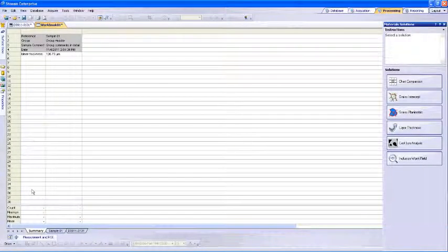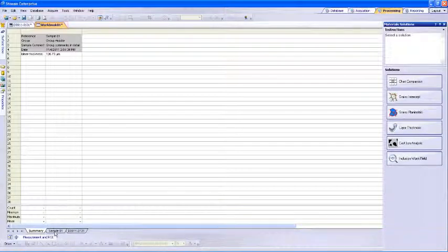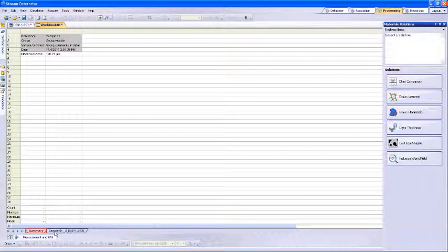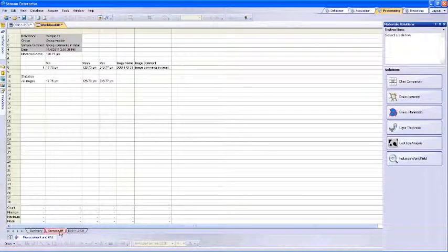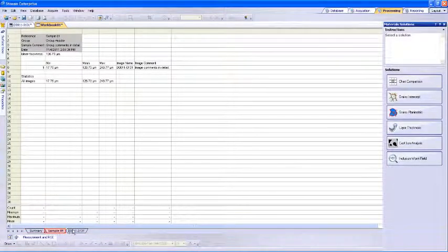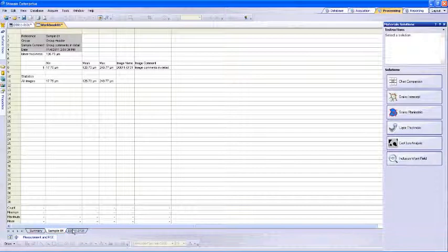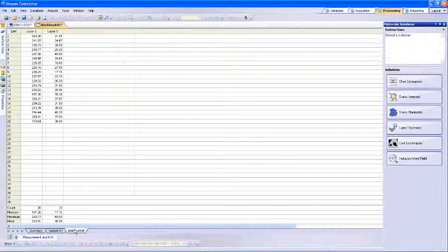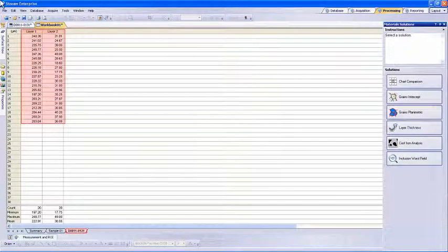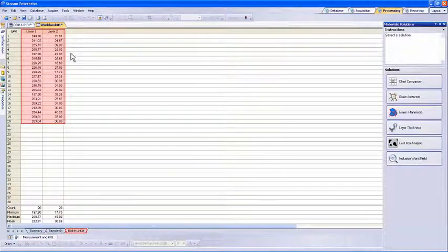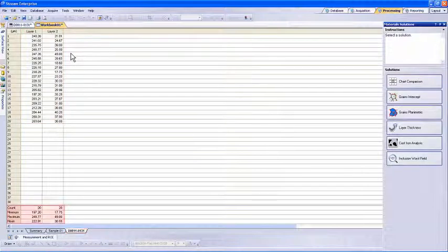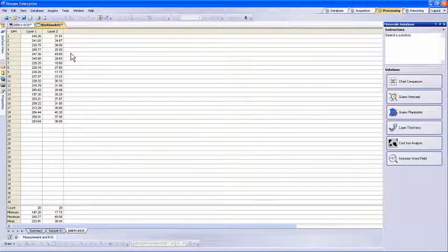Going back to the Stream software, we can also view the workbook that was generated. The first tab displays the summary. The second tab displays the sample results. The third tab displays the individual line measurements for both layers and the measurement statistics at the bottom. This workbook can be saved locally or within the database and can also be exported to Excel directly.